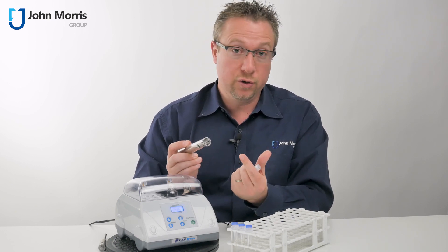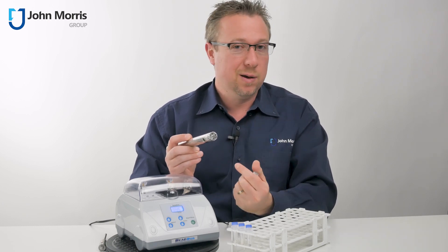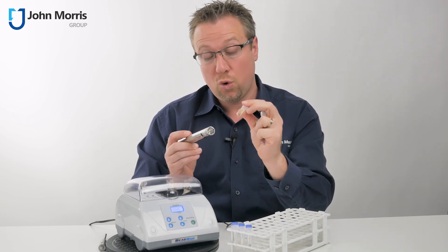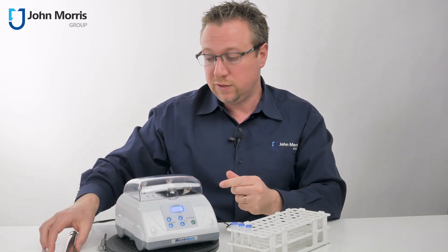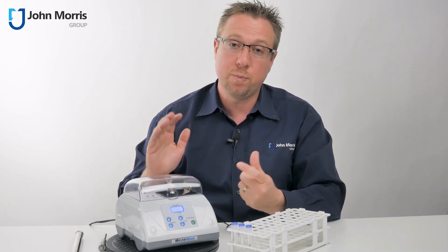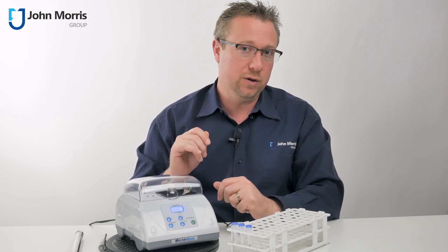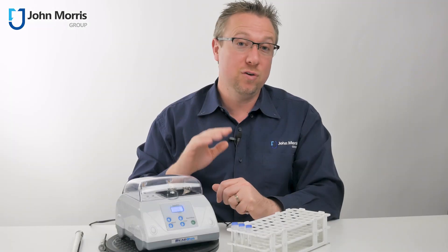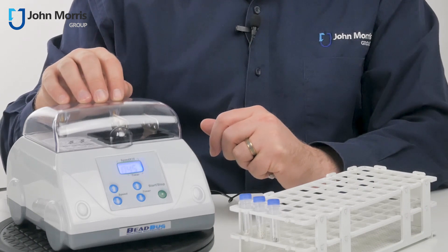So what else could you use? Well, you could use a vortex mixer — this essentially just vibrates and rotates something at high speed. But again that's not very aggressive and really won't break open a leaf or a tree or another sample like that. You can go for expensive solutions like mixer mills and pay thousands and thousands — you can pay $15,000 on a mixer mill and that'll do a tremendous result, especially if you need to smash open something in liquid nitrogen. But if you don't have $15,000, then the Beadbug 3 is a tremendous product.